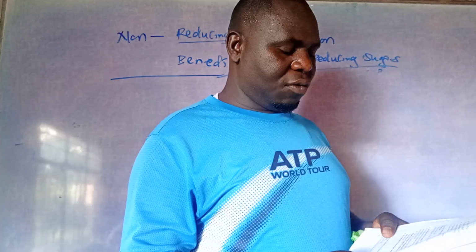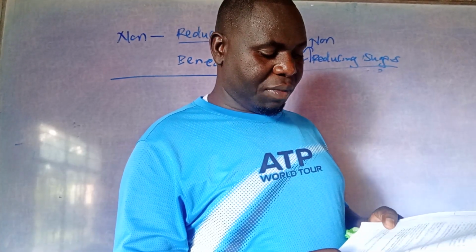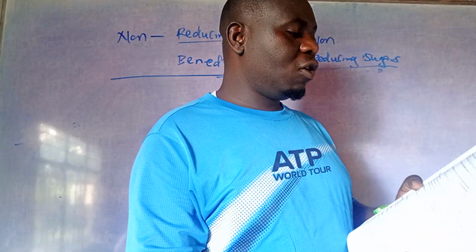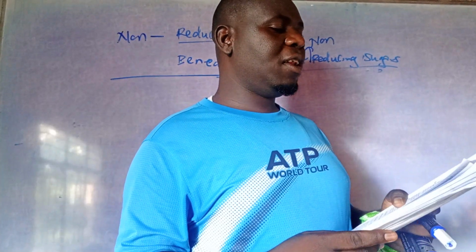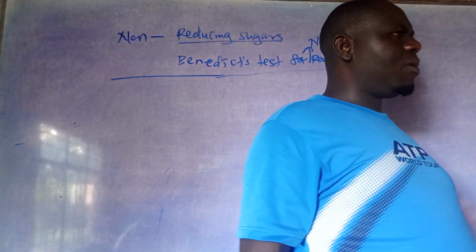I know we did the Biuret test for protein. So now we go straight to testing for lipids, the fats and oils. You know fats, right?